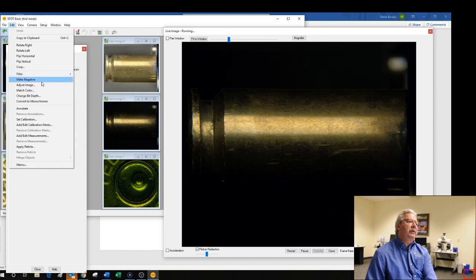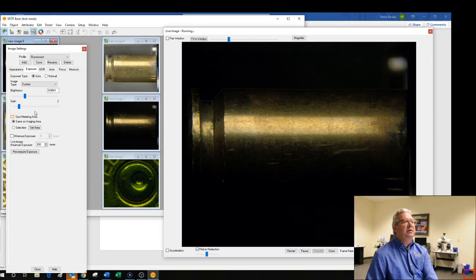And you can play with, there's a thing where you can make the image negative, match colors, do all kinds of stuff, most of which people don't want to hear about. Some people are very eager and anxious to find out about annotation now. So when we hit Annotate, the menu up here, don't know whether you'll be able to notice it, has actually changed.